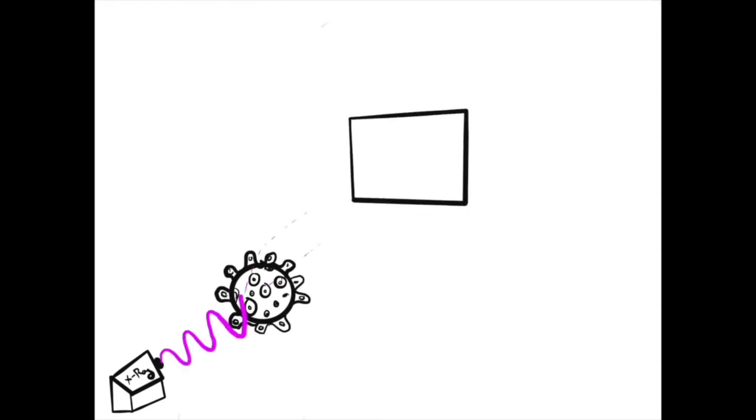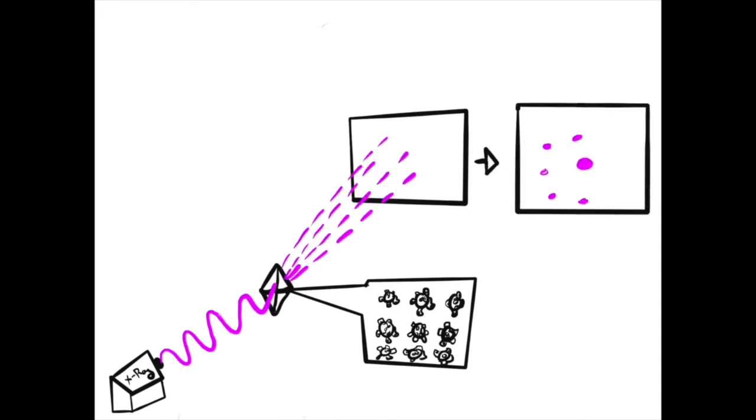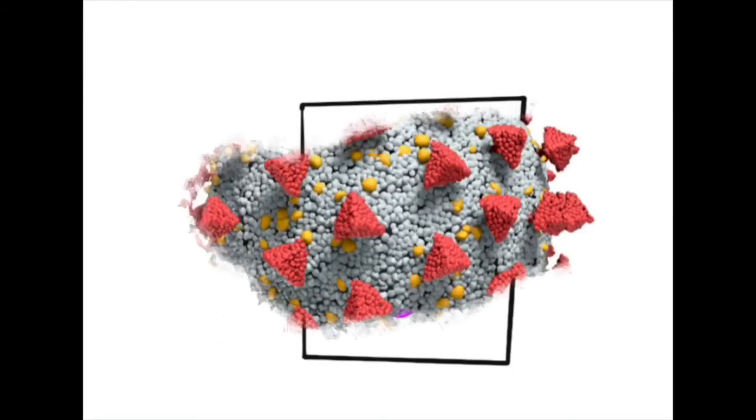However, in most cases, beaming an X-ray through a virus particle results in extremely weak diffraction patterns. So, just like how we were able to increase the intensity of the diffraction pattern by increasing the number of slits, here we can increase the number of virus particles by forming a crystallized lattice that holds the particles in an organized regular shape, which focuses the diffracted rays, allowing us to clearly see the diffraction pattern. By analyzing this diffraction pattern, we can create a complete 3D model of the virus.